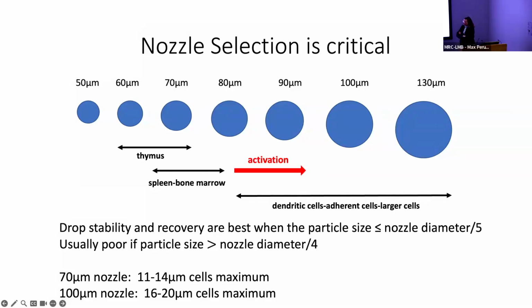A typical pressure of a 100 micron nozzle is about 20 psi. And once we get up to about 150 microns, you're looking at anywhere from 3 to 6 psi. So it's quite low. The trade-off to having a larger nozzle and a lower pressure is that you can't sort as quickly. And of course, larger volumes are generated.